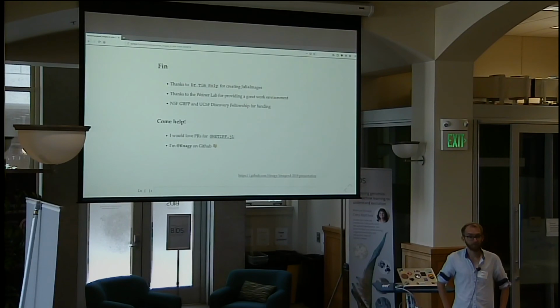Segmentation methods as well? For segmentation, there are all the basic ones: watershed, compact watershed, the various derivatives. All that stuff is built out. It's not as comprehensive, but I would say all the major stuff is there. I've definitely been able to do all of my cell segmentation really well with the Julia ecosystem. But there are some edge cases where MATLAB or Python have more available.